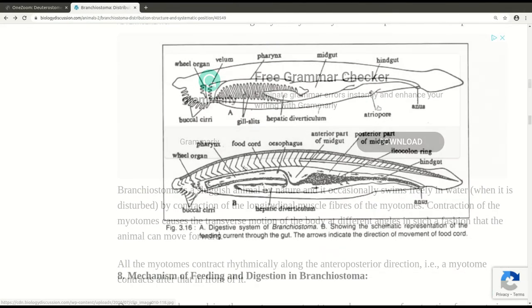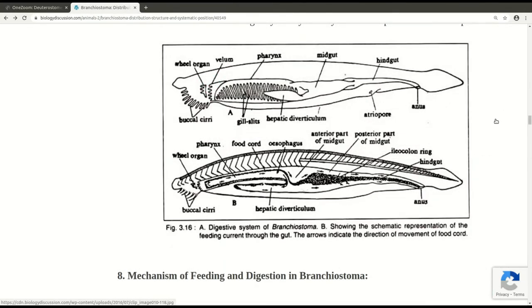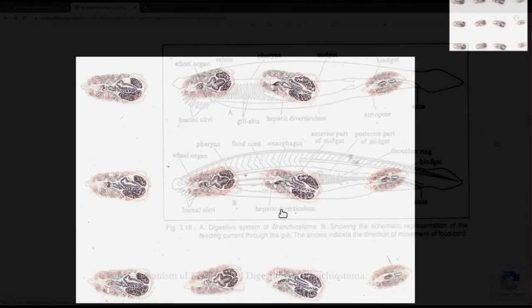If we have a look now at this diagram which focuses more on the digestive system of the lancelet, we'll probably get some sections with this organ called the hepatic diverticulum. We'll have some sections with mid-gut, and then we'll have some sections with hindgut as well. So if we go back to our slide, we can maybe start to pick out some of these features.